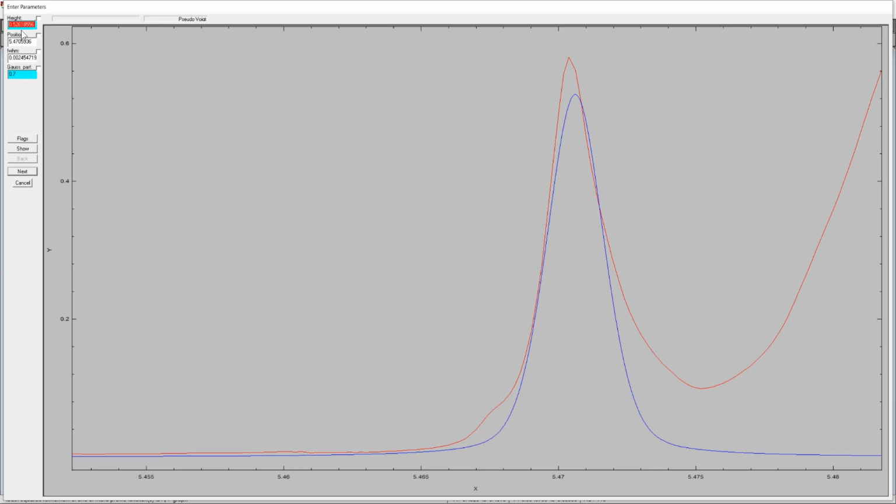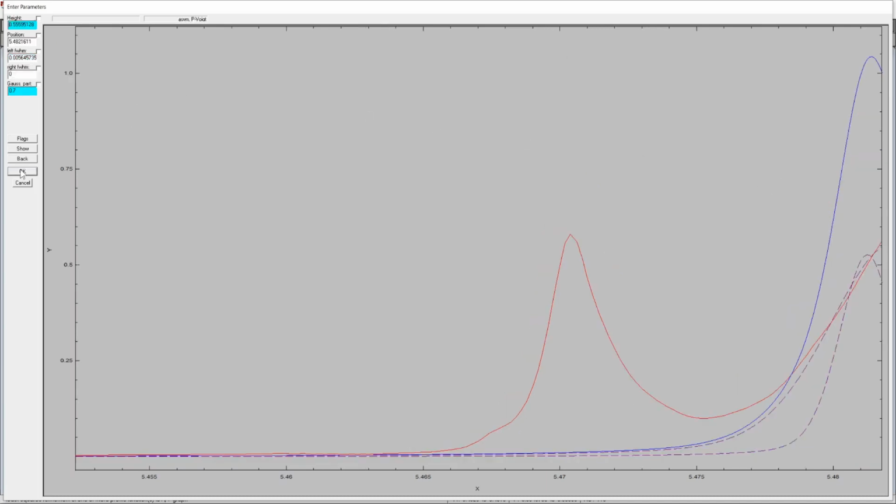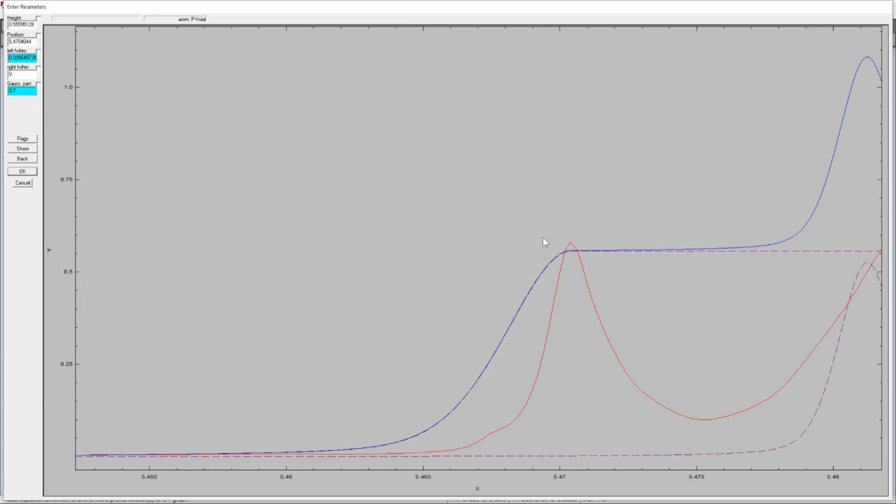And so this is actually what we want to use for the edge. So we have to shift this peak over to the edge and use the next peak now for the pre-edge peak. Since we now have an asymmetric profile function, we need to select two full widths at half maximum, left and right.